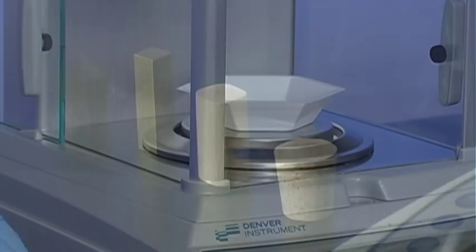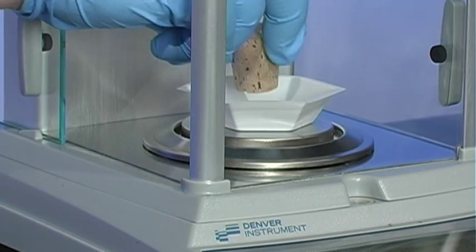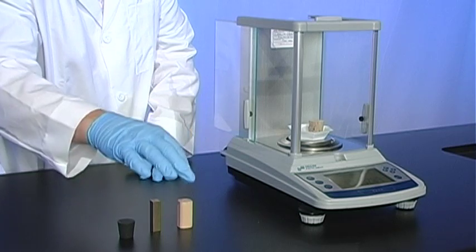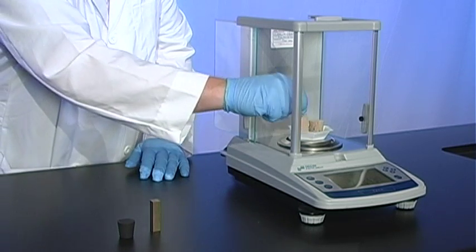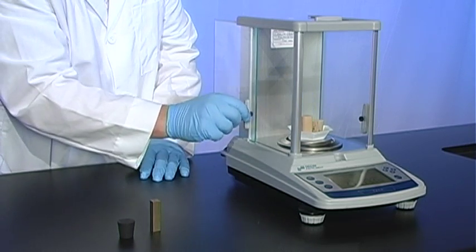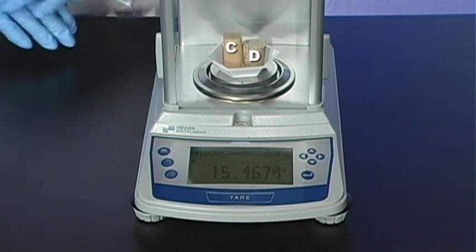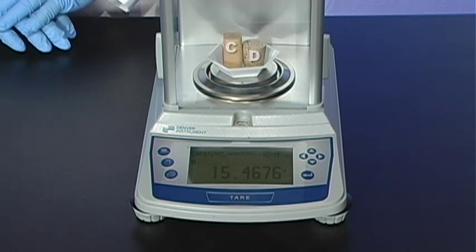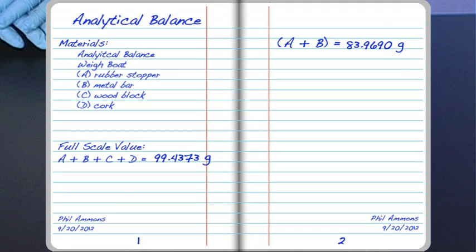Weigh items C and D together. The combined mass is 15.4676 grams. Record this value in your lab notebook.